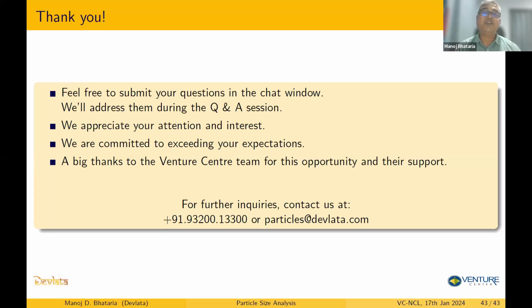Third is the kind of sample cells that you're using. If you're using acrylic cells, then probably it will rule out acetone. Then you have to go for a glass cell. Those are more expensive, so it's an expense. It's also the kind of reactivity, the chemical compatibility with the things. And otherwise, there is not much of a problem.